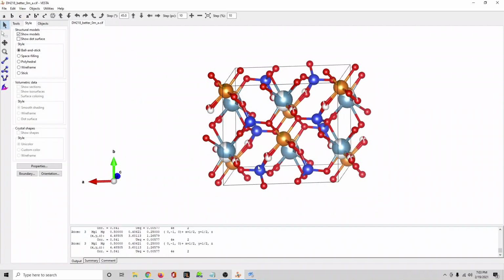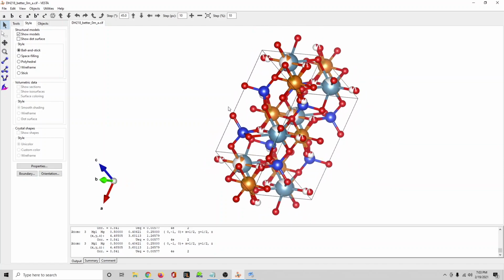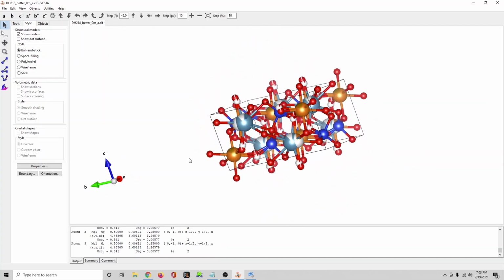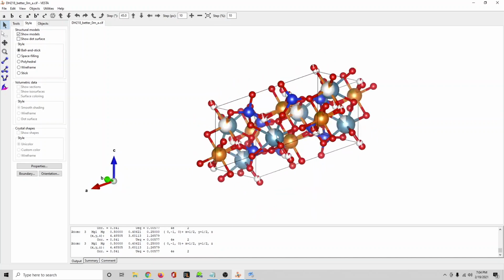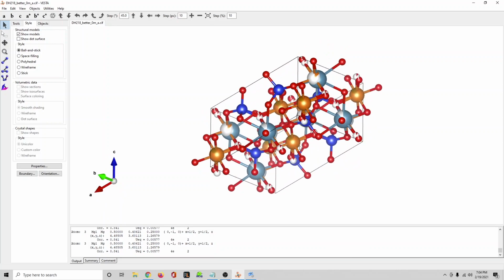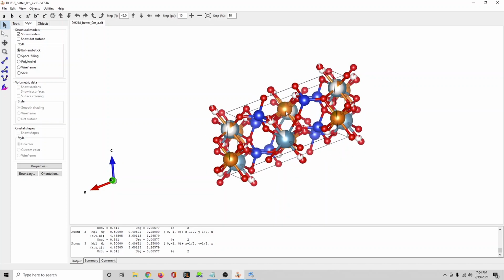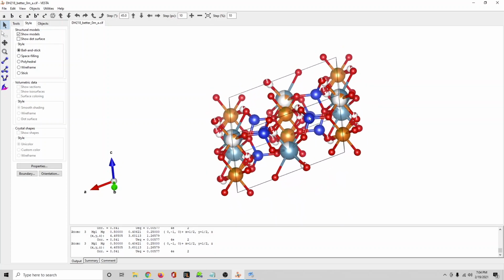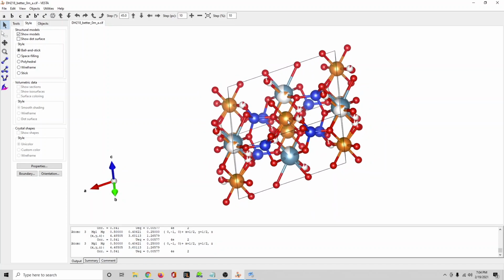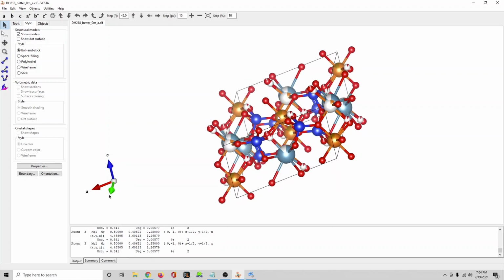Actually, I'll show you just some examples of what a typical pyroxene structure looks like. It's one of the first complex crystal structures solved by Lawrence Bragg. The structure that he solved was essentially an end-member magnesium structure. This one has some iron substitution. So you see this octahedral site here in the middle. That has probably 15% iron I've modeled in this.